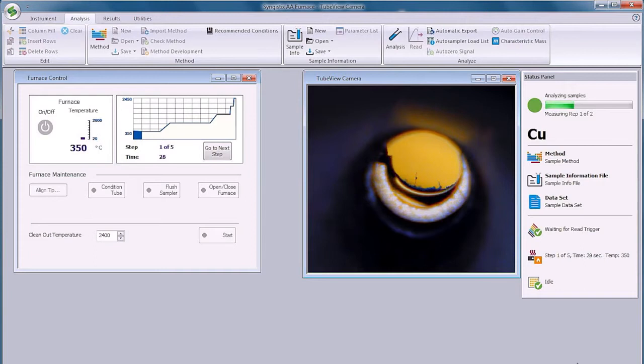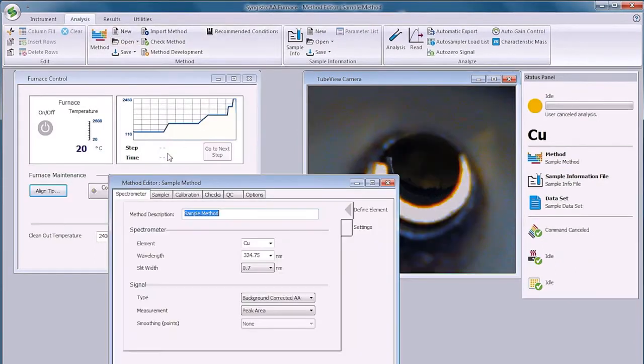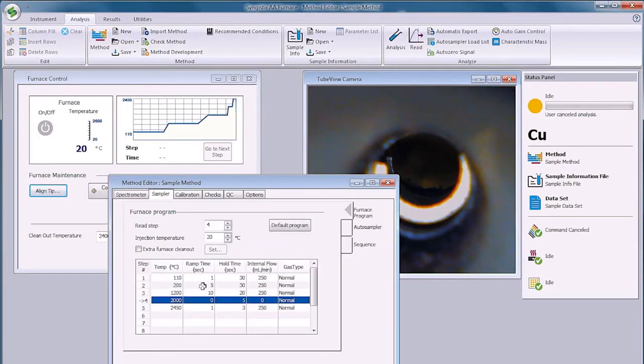Carefully monitor the sample in the drying phase using the furnace viewing camera or the dental mirror. If you see the sample boiling vigorously, change the furnace method, increase the ramp time or the drying steps, or reduce the programmed temperatures.